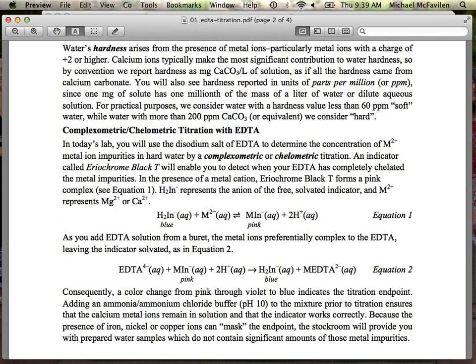So you all said dissolve it in water. Why did you dissolve it in water? This is in water. Why not just add the solid directly to this? It comes to control. Control and time. If you want to add small amounts at a time, we could add a grain of EDTA each time. But every time you do that, what do you need to know about that grain? How much it weighed. So you'd weigh out a grain, add it to your solution, swirl it around to get it dissolved. Nope, didn't change. Go weigh out another grain, add it in. That gets a bit tedious.